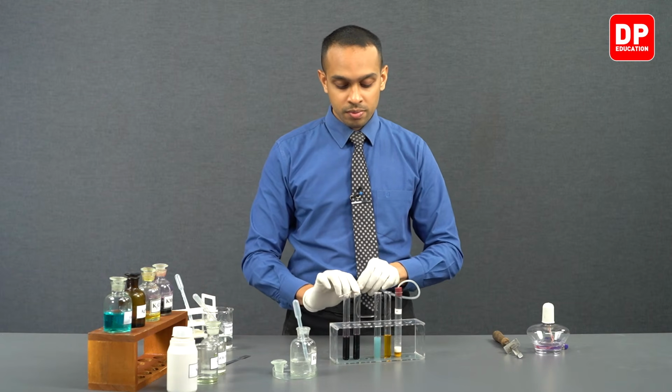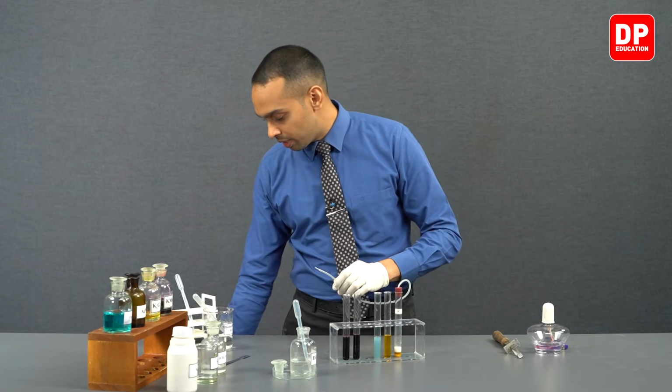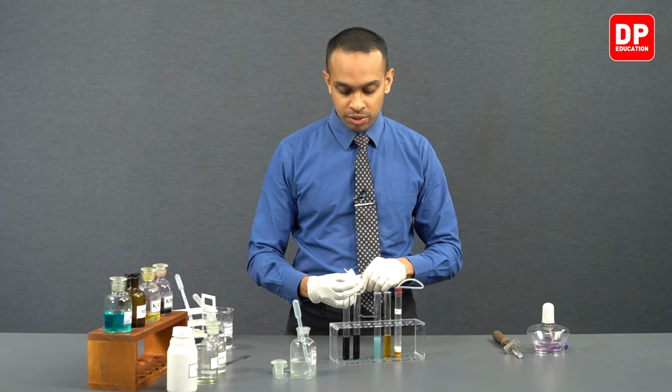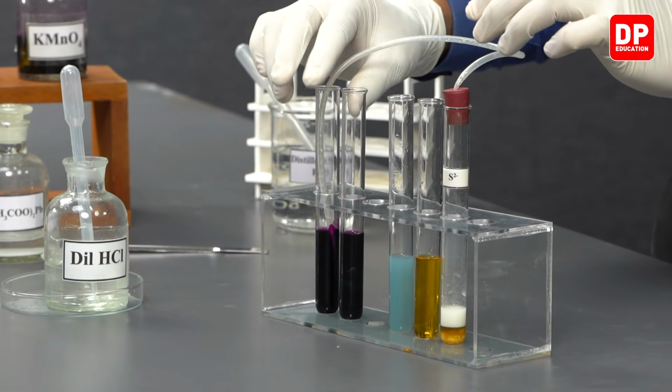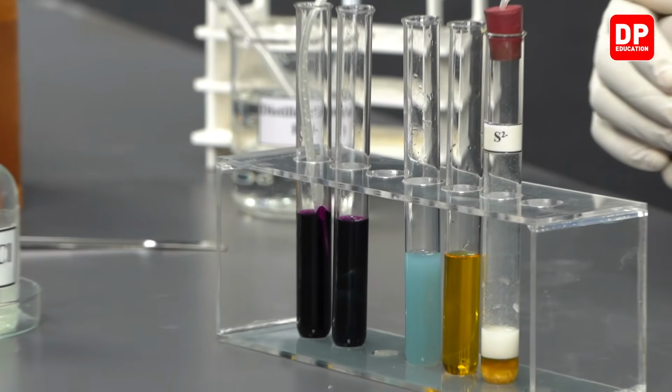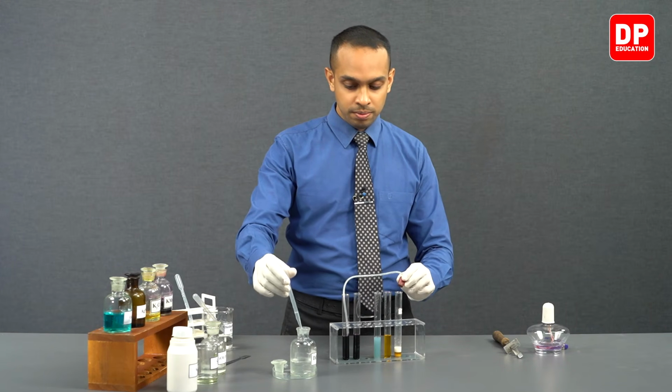Now let's insert this delivery tube. After cleaning it, let's insert this delivery tube into our acidified potassium permanganate solution, and let's add a little bit of HCl.